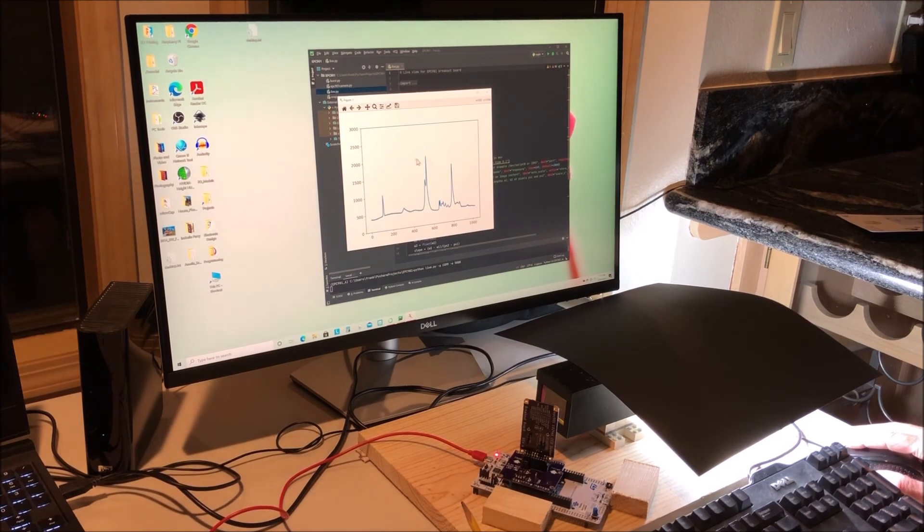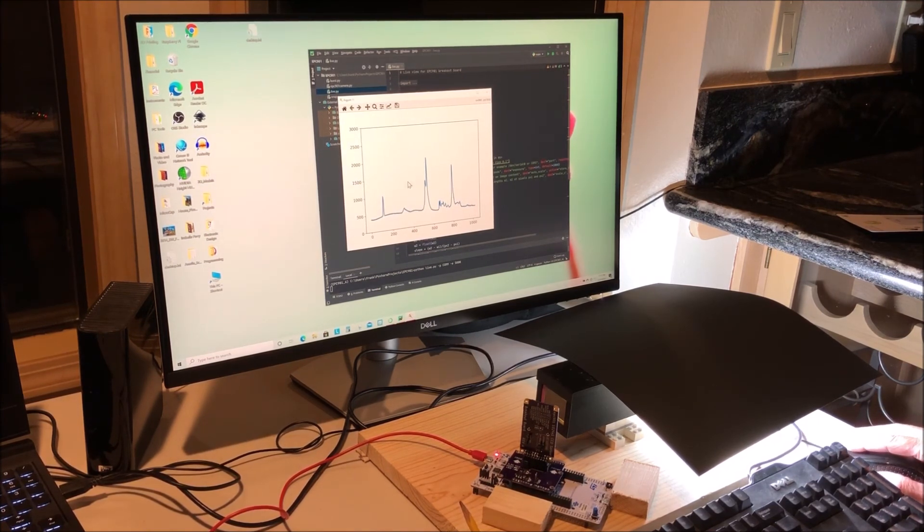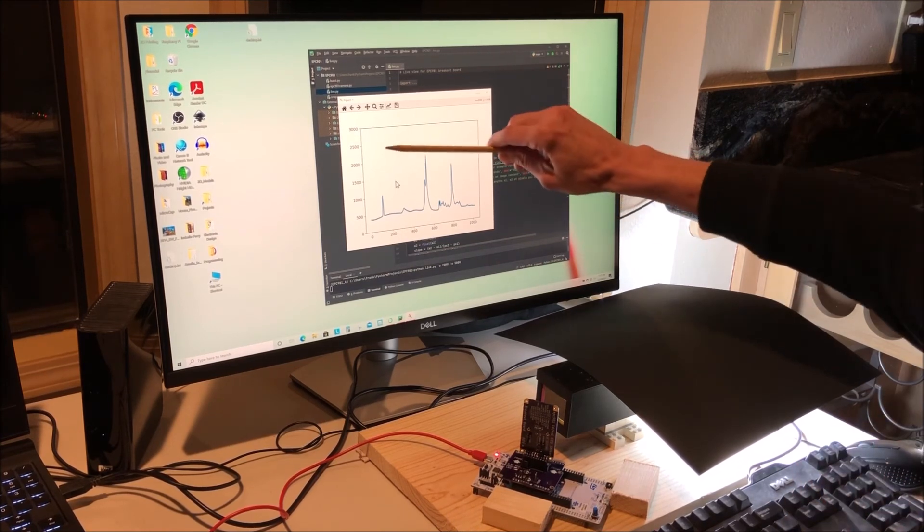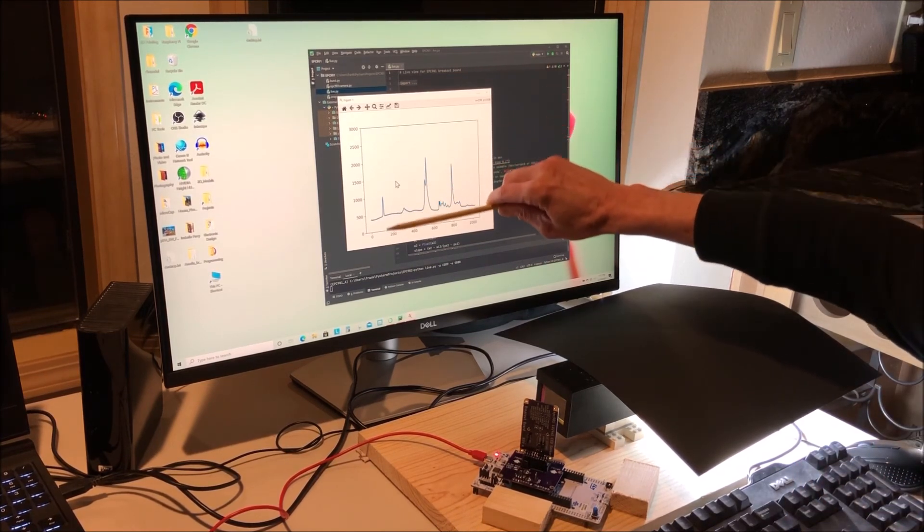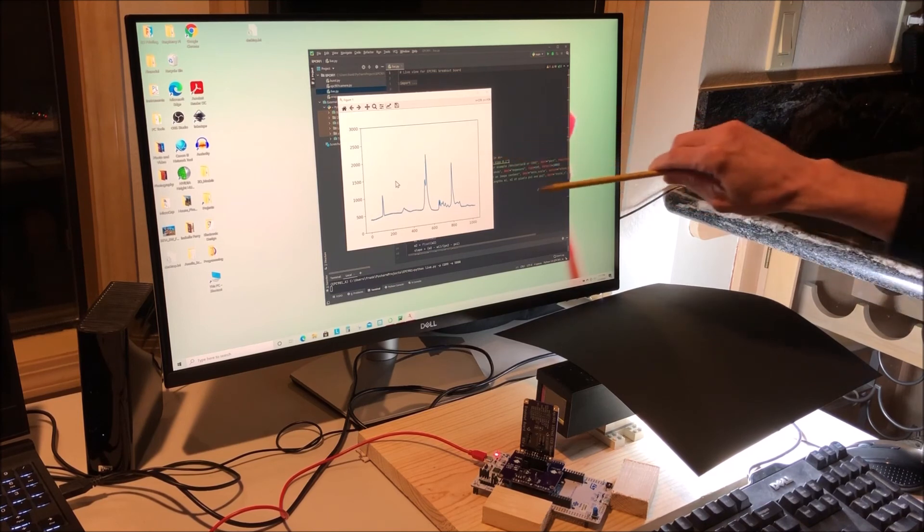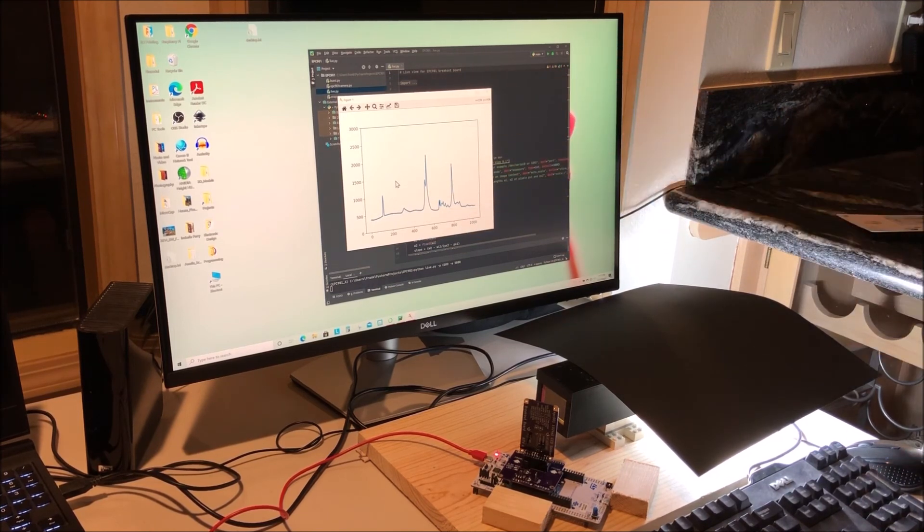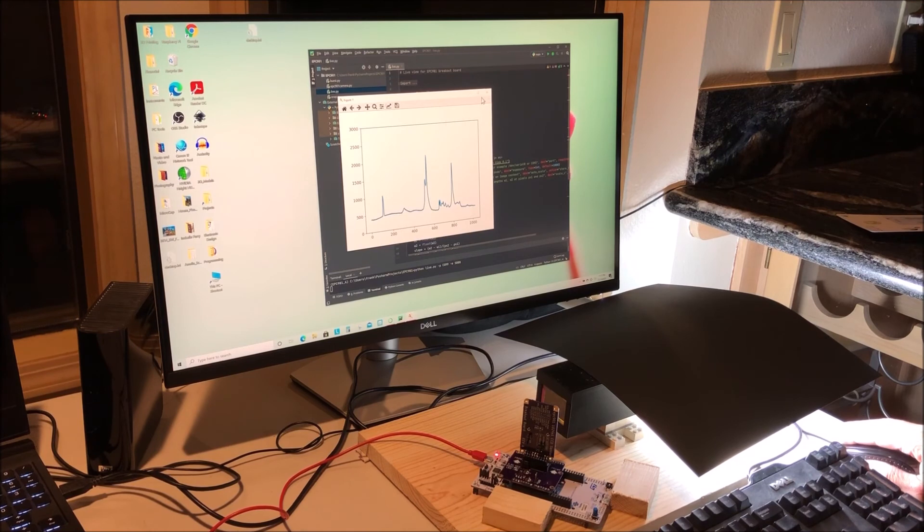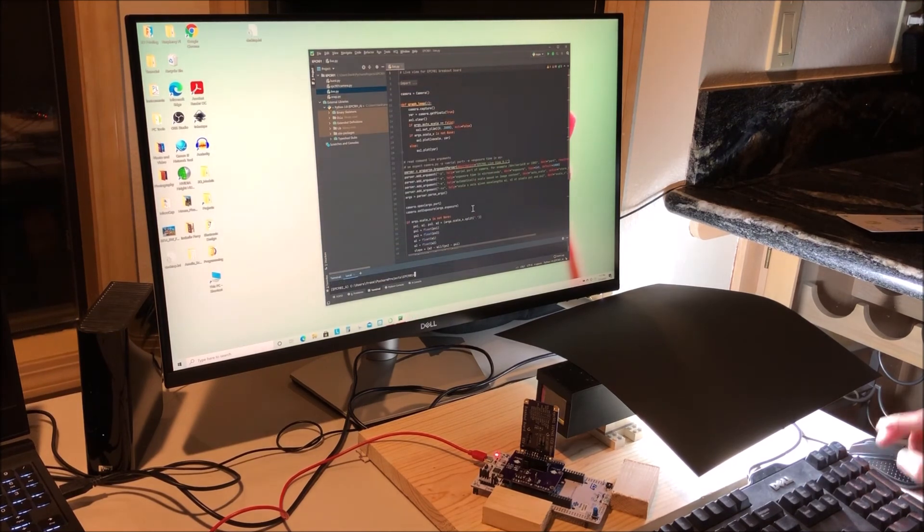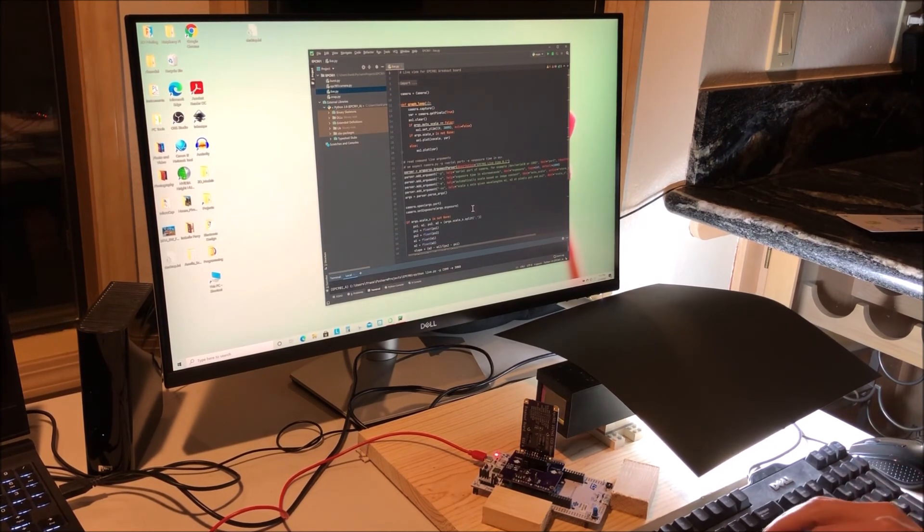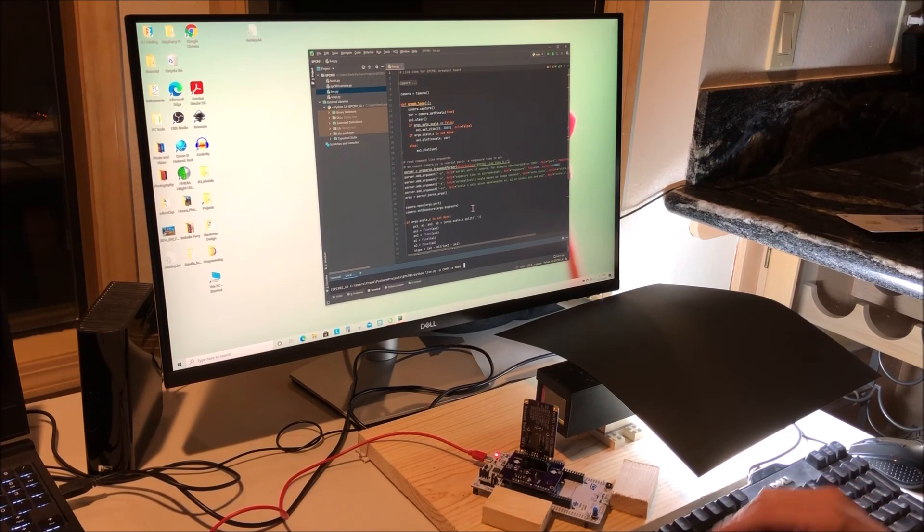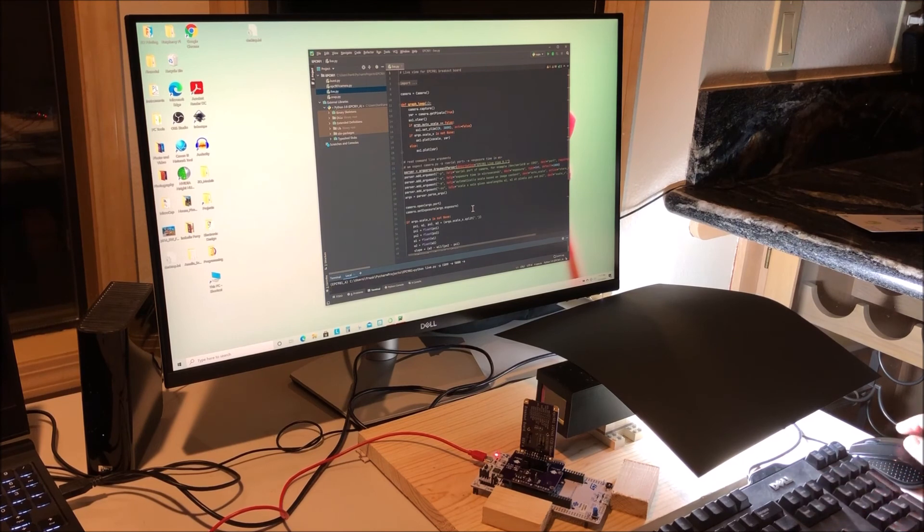There we go. That's better. It's not clipping for sure. Now there is another feature that's really nice which allows you to automatically scale the y-axis. I'll do that now so we can see the spectrograph a little bit better. That's done with the dash a for auto scale. And have a look.